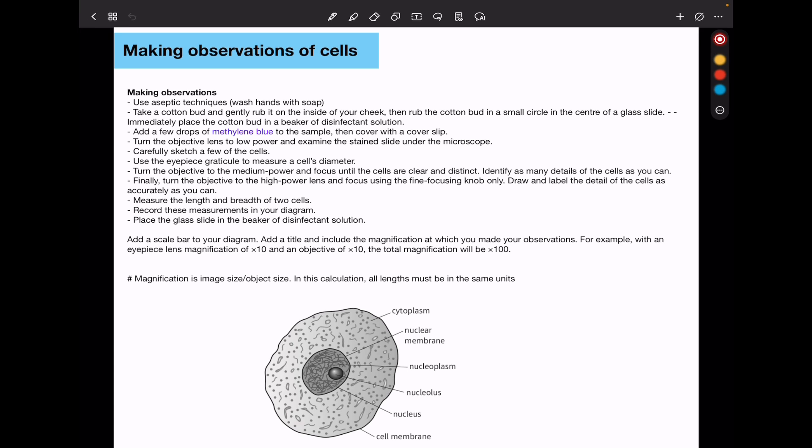You'll turn the objective lens to low power. Like again, we observe under low power first so that we can locate. So under low power and examine the stained slide under the microscope, you could locate and then carefully draw or sketch the cells that you observe. Then you could use the eyepiece graticule to measure the cell's diameter. This is similar to what we saw when we were calibrating. You turn the objective to medium and focus until the cells are clear and distinct. Then you identify as many details as possible. You could also draw what you see.